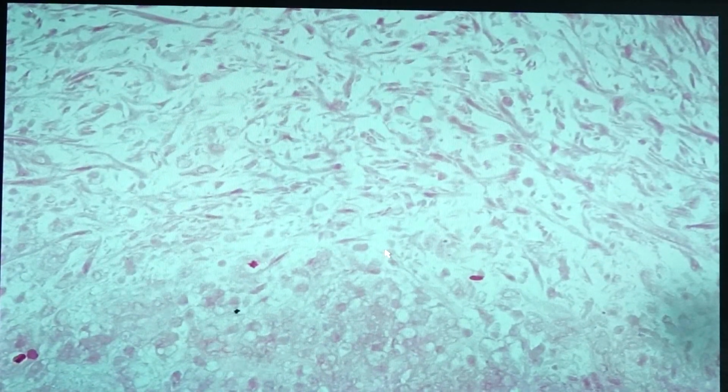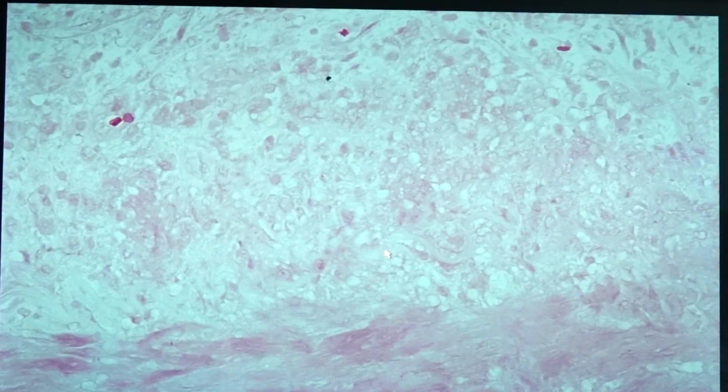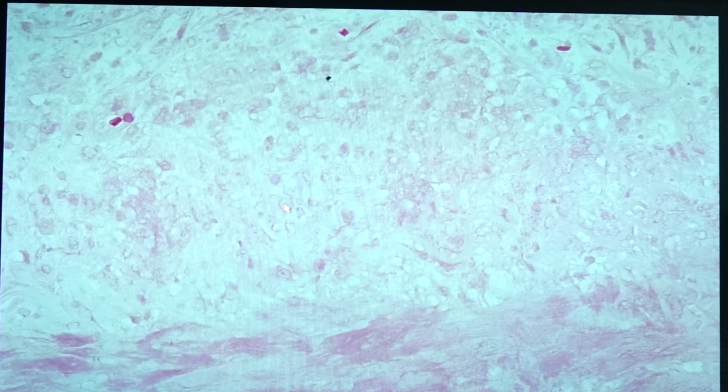The intima would show the presence of a chronic granulomatous inflammation, characterized by the presence of these macrophages and some T cells. So we have a chronic granulomatous inflammation, and it's not clear here, but there would be the presence of fragmentation of the elastic lamina. This would be in this area. So again, presence of inflammatory cells. These are macrophages because it's a granuloma. So these are epithelioid histiocytes accompanied by lymphocytes. So this is temporal arteritis.